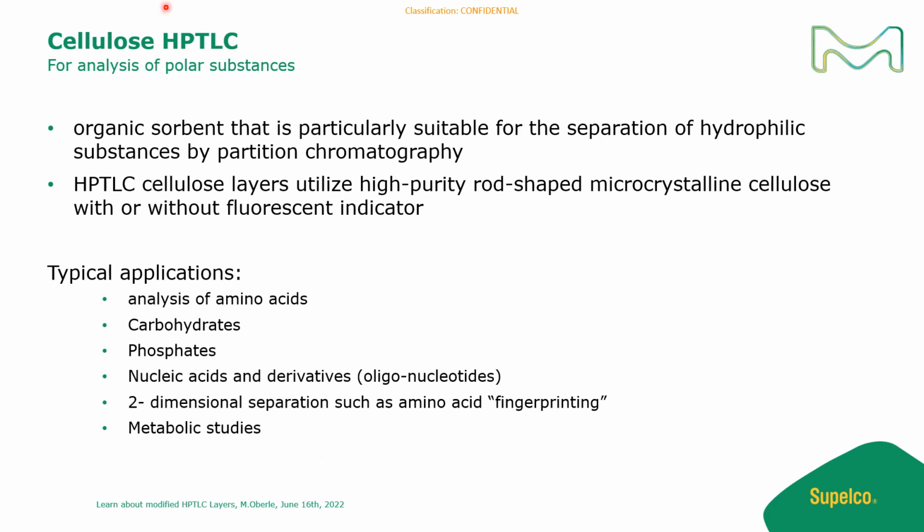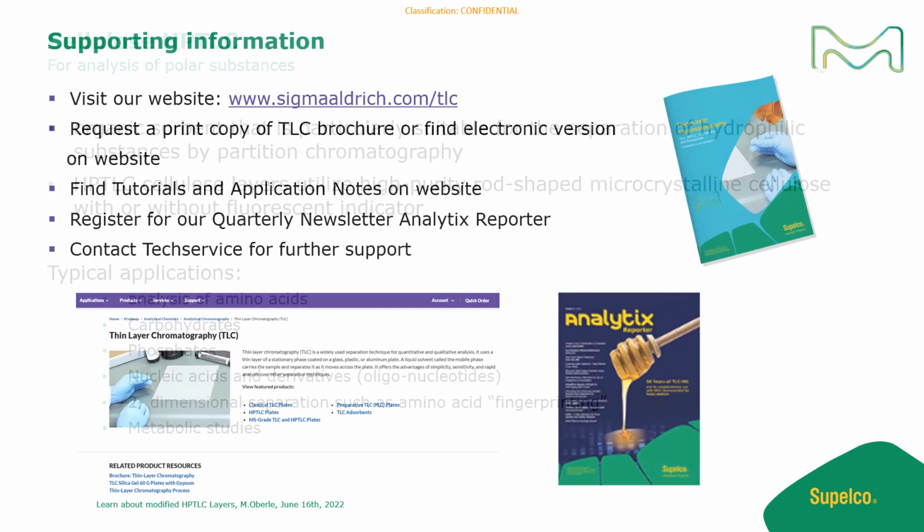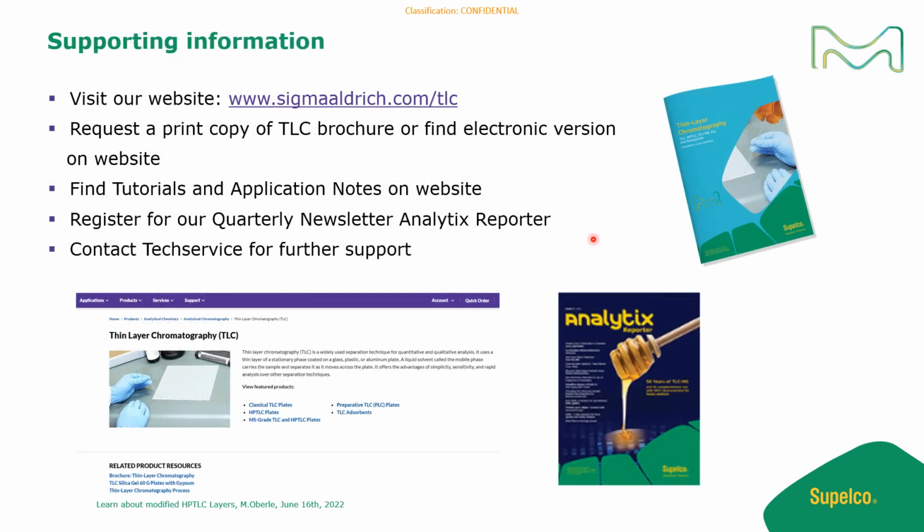I hope I could inspire you to try out some other layer modifications besides the normal phase to solve your analytical problem and to increase your separation quality.